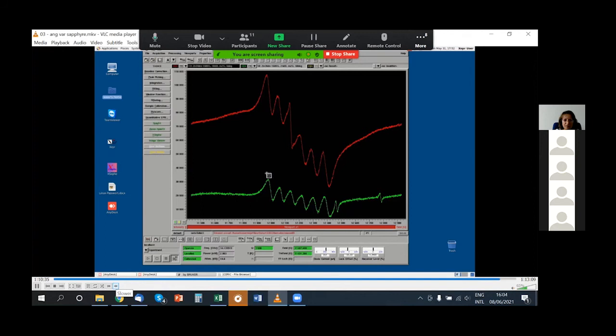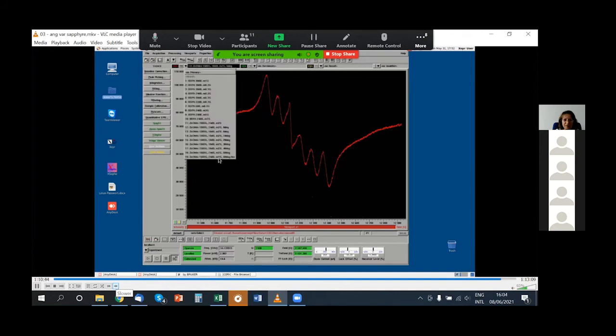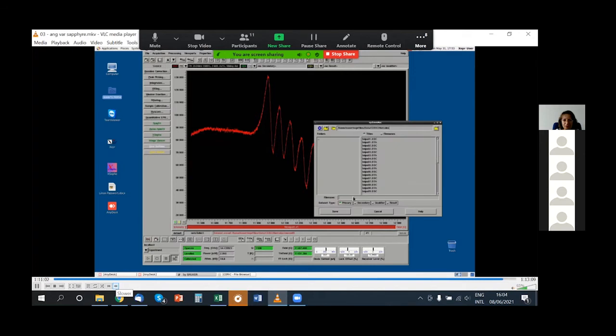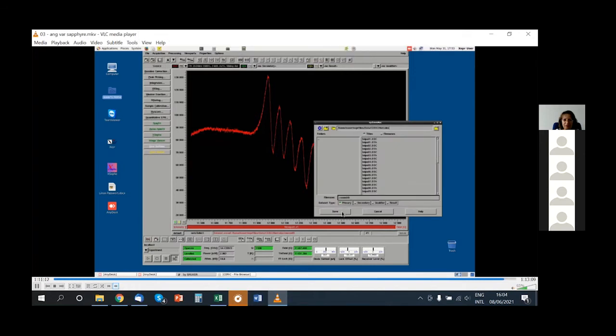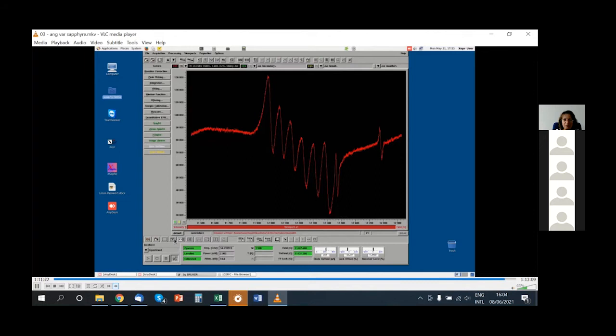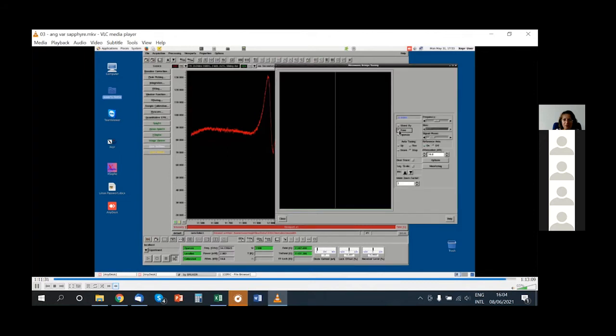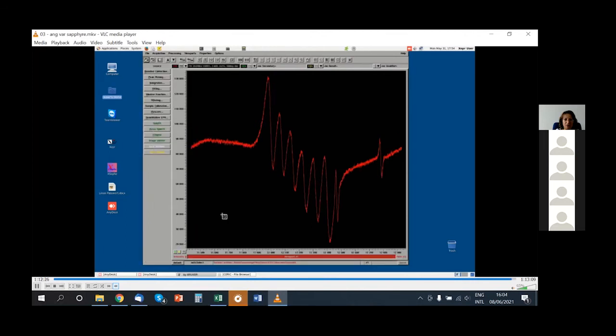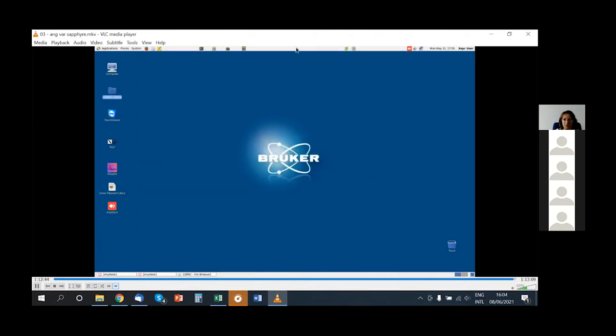It was too fast here. So we can also export data to be used in further programs. And now the procedure to stop the experiment. We are disconnecting from the hardware. We exit the program, and this was all.